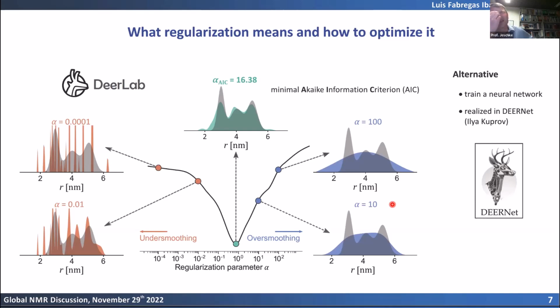On the other hand, what we have checked in one case, in the HNRP-A1 case, and in two cases actually, also in fused in sarcoma, is that the freezing doesn't seem to change the conformation very strongly, but this may be different from protein to protein.